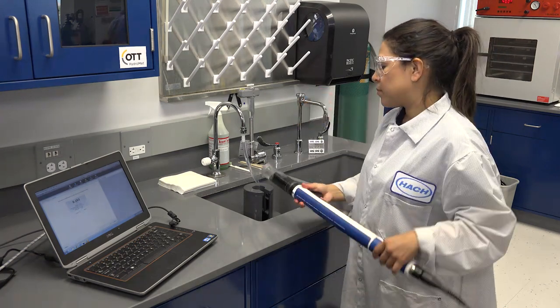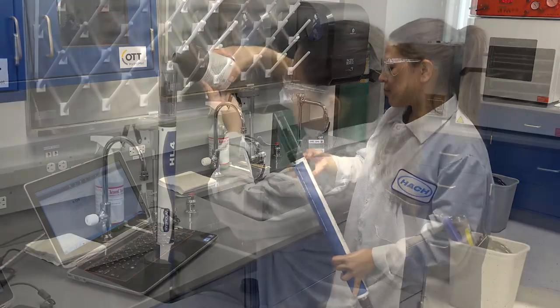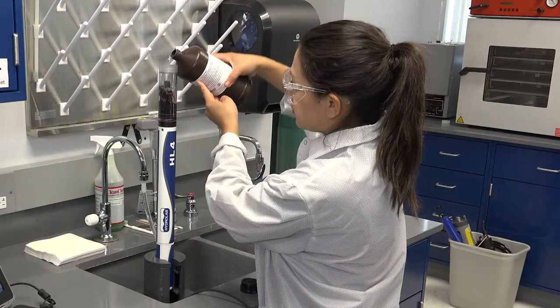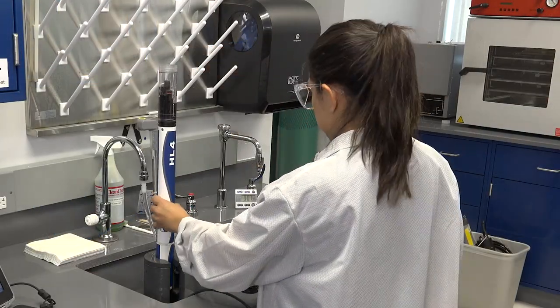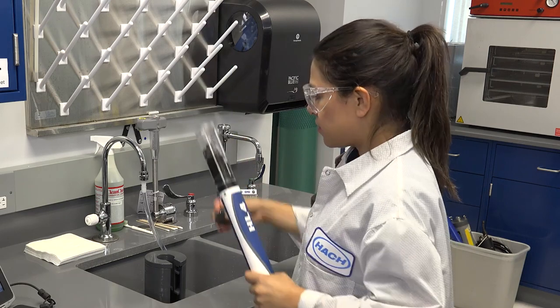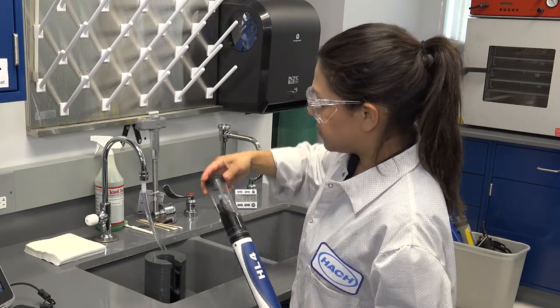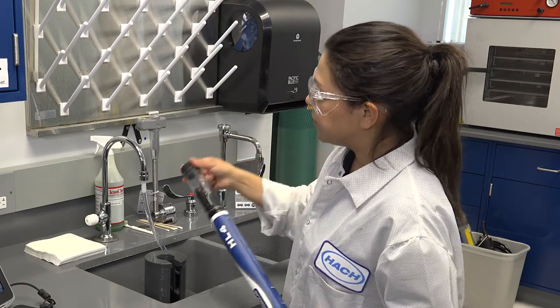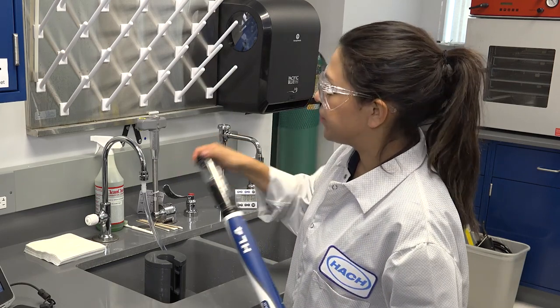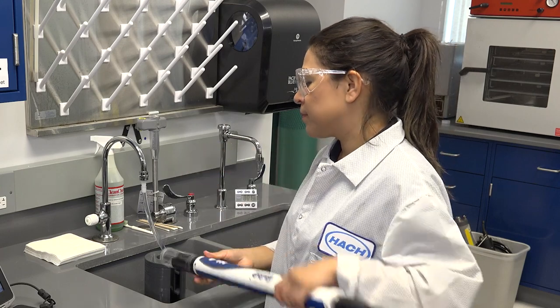To perform a calibration check, you will need a standard with a value that was not used in calibration. Be sure to follow the same steps of rinsing the sensor in deionized water as well as rinsing with the selected standard for optimal results.